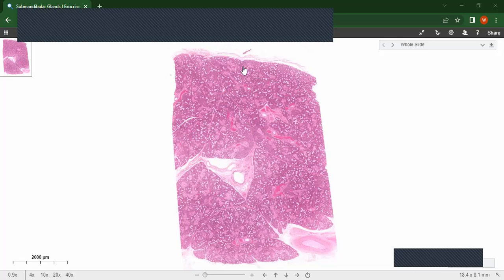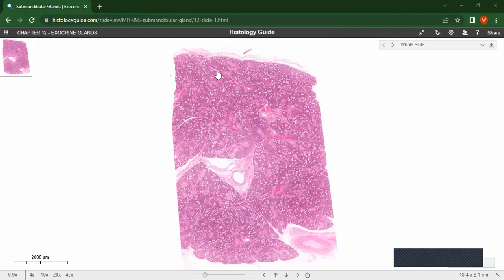The function of the capsule is to bring in the blood vessels, the nerves, and the lymphatics into the gland. The blood vessels enter into the gland via the stroma, such as through the capsule and the trabeculae which the capsule sends into the gland to lobulate it. The parenchyma is the functional component of the gland, and it consists of the secretory cells and the ducts.